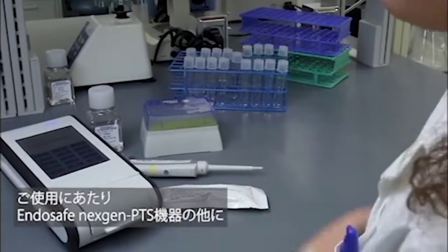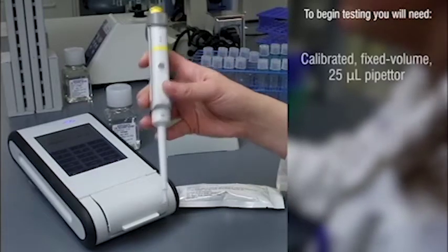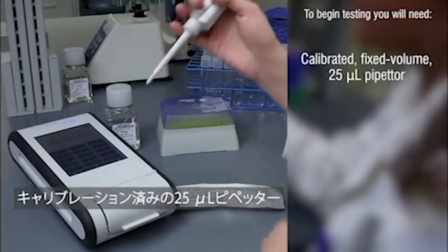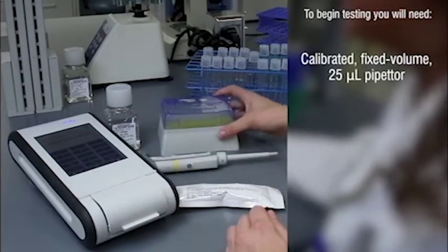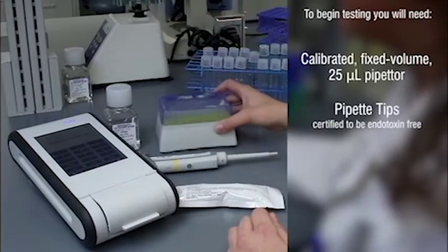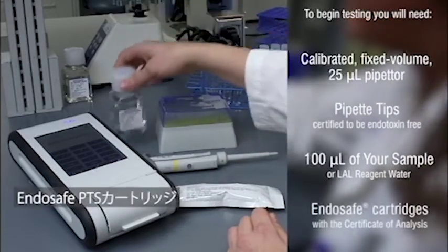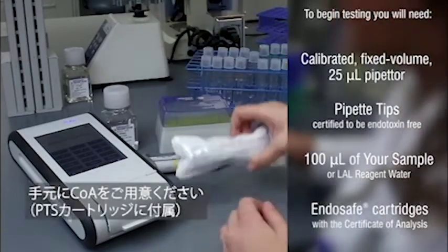In addition to your NextGen PTS reader, to begin testing you will need a calibrated fixed volume 25 microliter pipetter, pipette tips certified to be endotoxin free, your sample or LAL reagent water, and EndoSafe cartridges with the certificate of analysis.